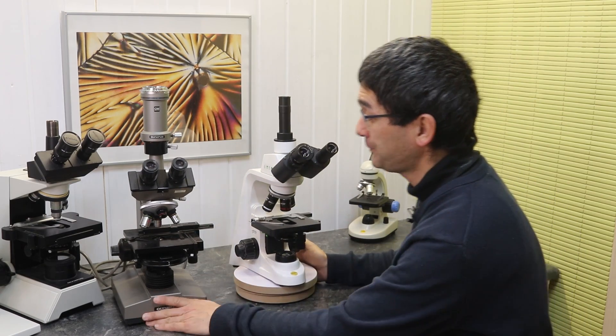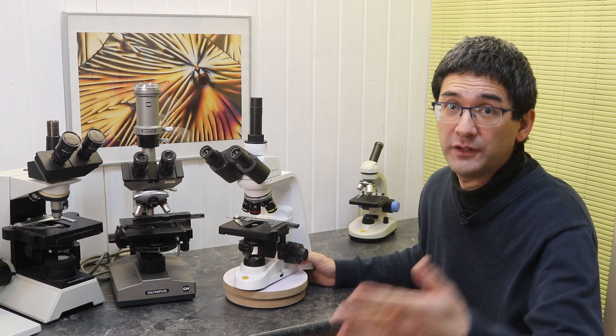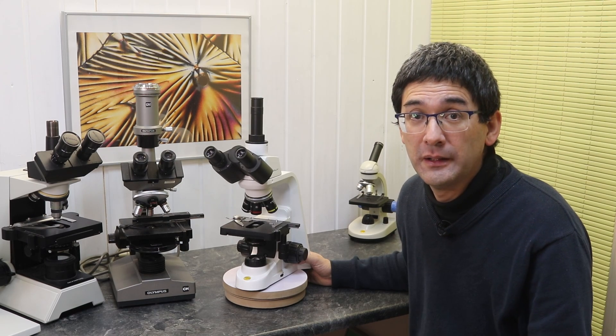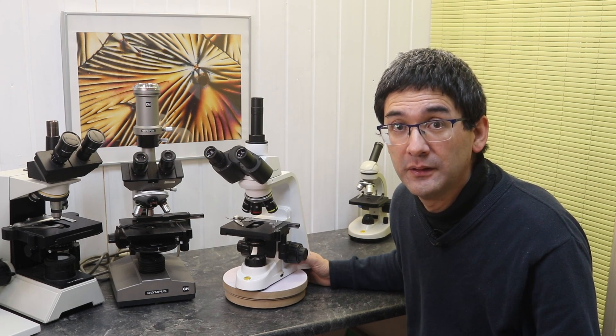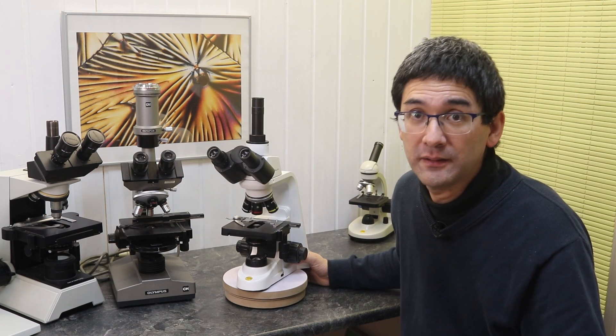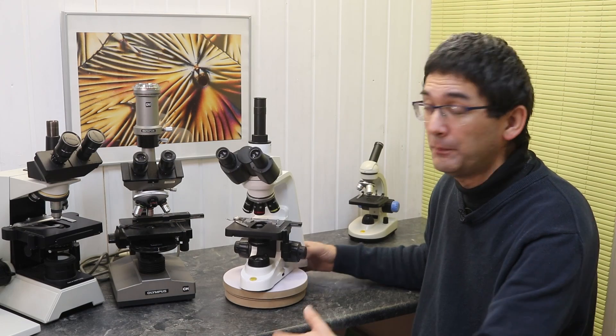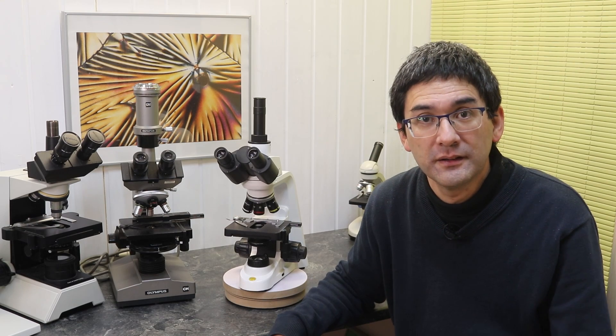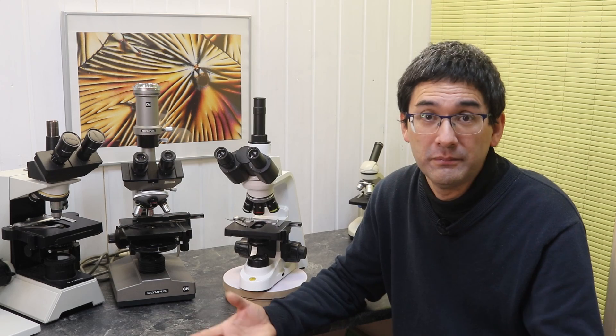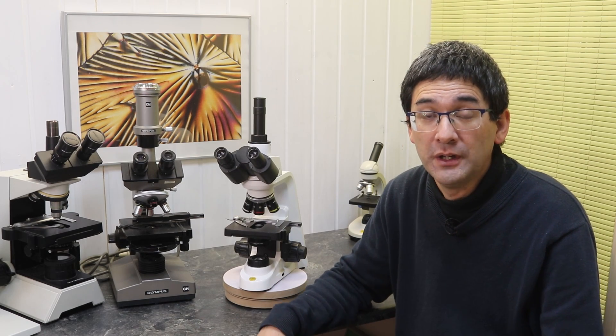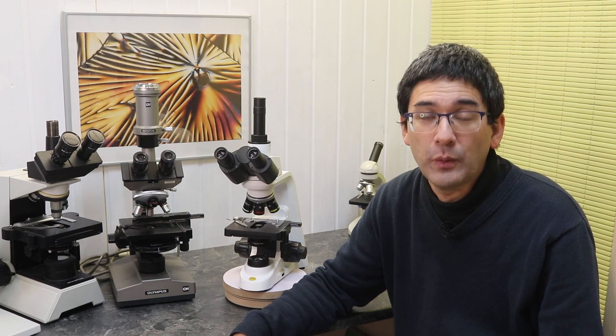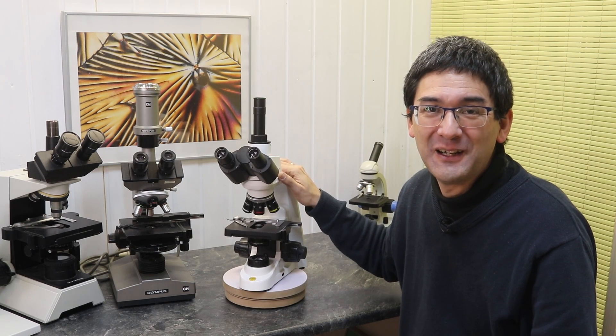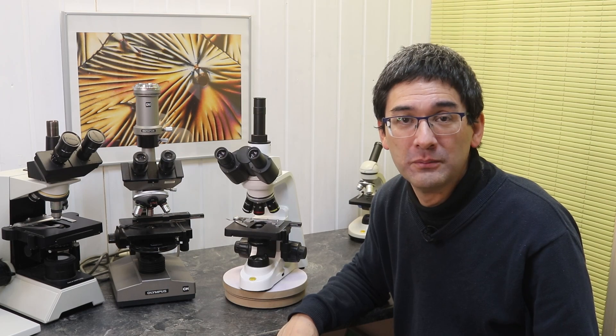This one over here, nice out of the box, very great. But I recently got a question from one of my viewers - can you get a replacement LED for this one? And the company said no, you can't, we don't sell it, because the company just rebranded the microscope but it actually comes from China. I did some Googling and I did find some replacement LEDs after all, so you basically have to find alternative solutions here. So the philosophy is quite different. But then you really get a functioning good microscope out of the box which you can use directly for observation.